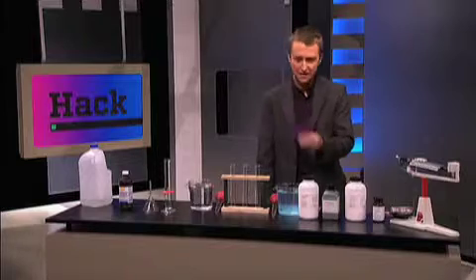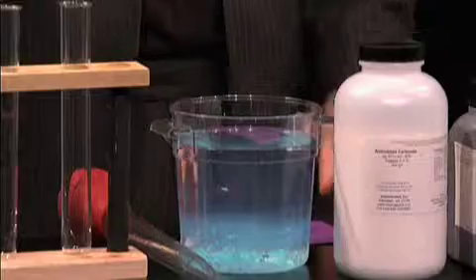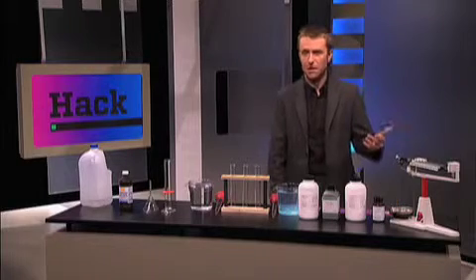Dump that in on your little squares of paper that you've made at home. This is going to help light up the luminol. You see, the luminol is looking to steal electrons from the metals, sort of like the copper in copper sulfate or the iron in a blood stain. Now, luminol can only dissolve in highly alkaline solutions because it's crazy like that. That's 11.8 pH, by the way. Note to self, do not drink this, do not touch this, do not throw in eyes or pour on children.